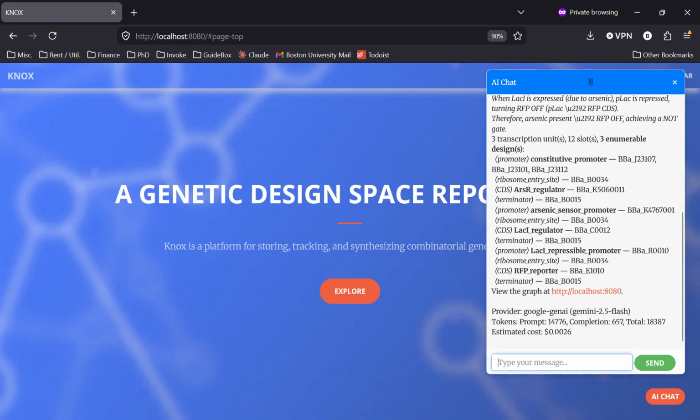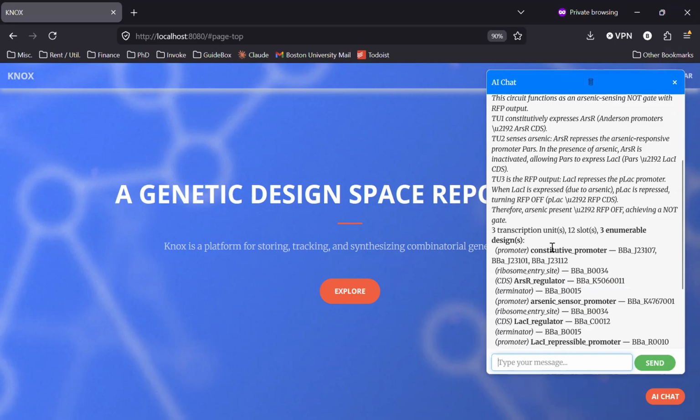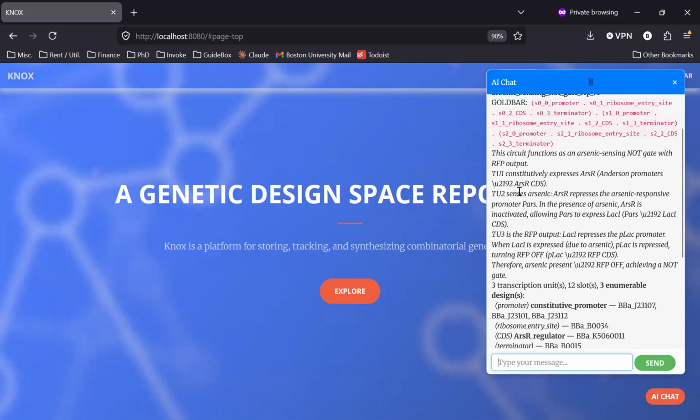All right, we have our result. Okay, we have a constitutive promoter, RBS, arsenic regulator, arsenic sensor promoter, lac I, okay, RFP reporter. Okay, so how does this work?